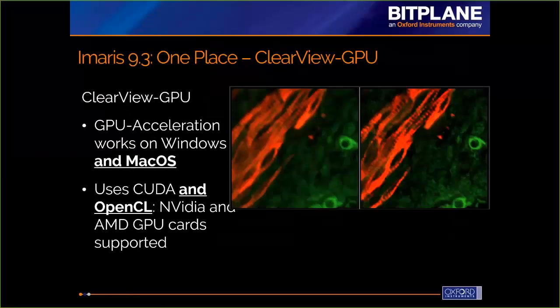What I find so cool about this, such a dork, is that it's able to run on both Windows and Macs. So we are bringing to you guys the ability to do GPU accelerated decon on Macs, and that's something that you haven't been able to do before. And so I'm very excited about that because I know we have a good number of Mac users out there. And not only is it running on Mac OS, it's also using OpenCL, and that allows it to use both NVIDIA as well as AMD or Radeon GPU cards.